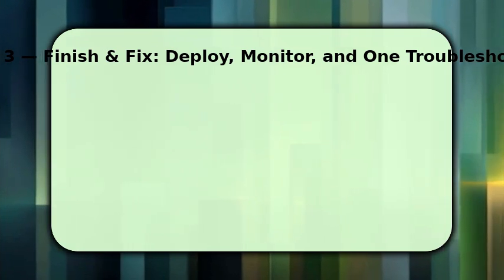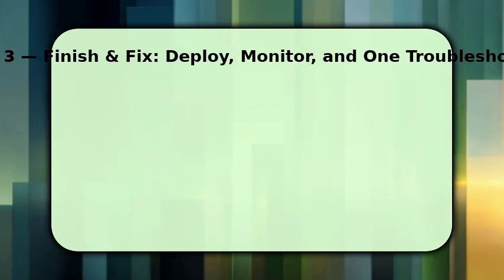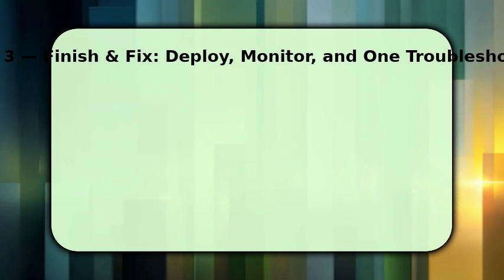Finally, validate by inspecting residuals and the difference curve. If peak positions shift or residuals show systematic structure, revisit calibration.